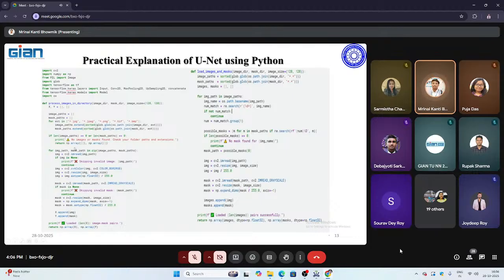Here also we check whether it is resized or not. Then image masks have been considered into two arrays or matrix representations. For image path, we check whether the image is present or not with that particular name, and the image name will be the same. If there is a different name, then you have to rename those images again with different Python code, because a fixed name is better to extract all kinds of images. You have to keep a fixed name and fixed extension.